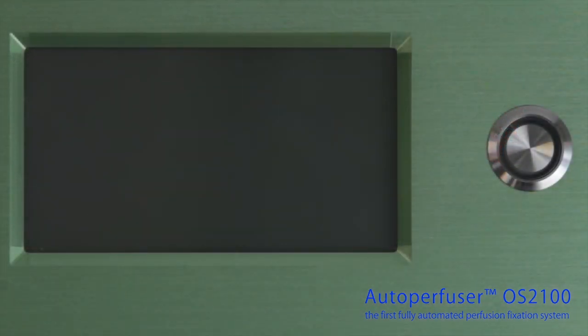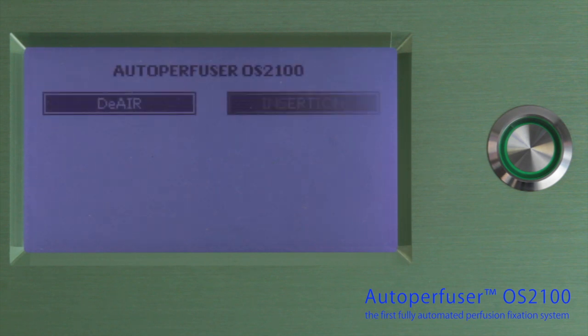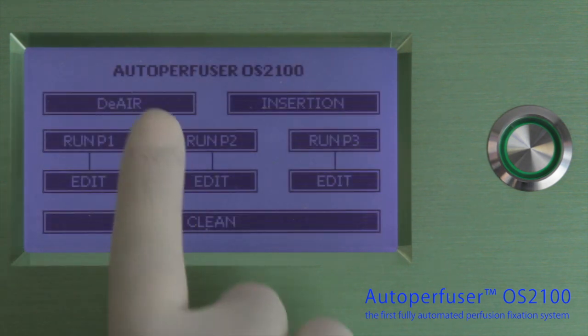All programming is done via an LCD touchscreen panel with a very user-friendly interface. You can easily de-air the tubing with one simple touch.